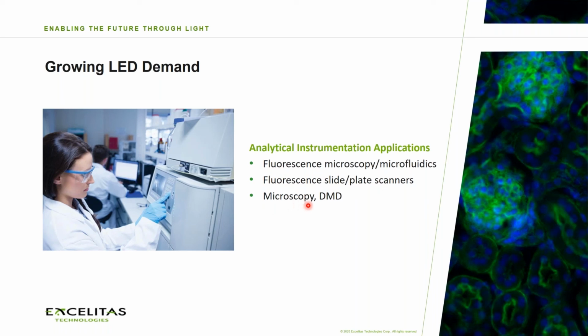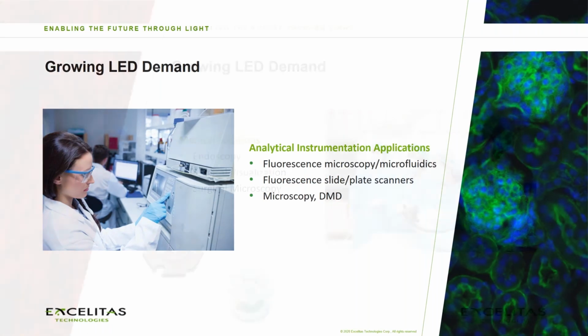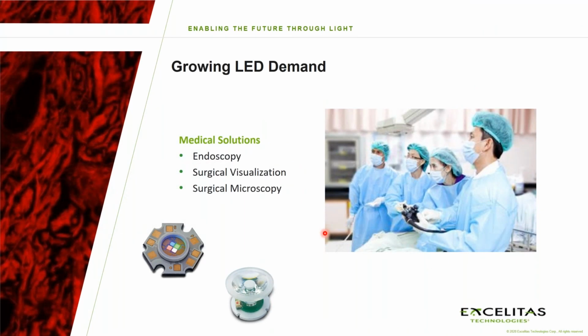It's not only limited to analytical and microscopy applications, it also extends over to endoscopy, surgical visualization, and surgical microscopy. Along with the white light that a surgeon uses in this device that he's holding, to go into a body cavity, they also want to excite fluorescence now. So that's either UV or infrared, but there's also a fluorescence angle to endoscopy.